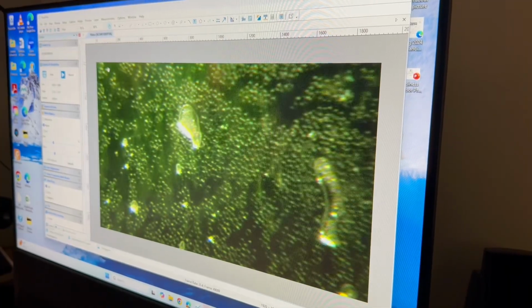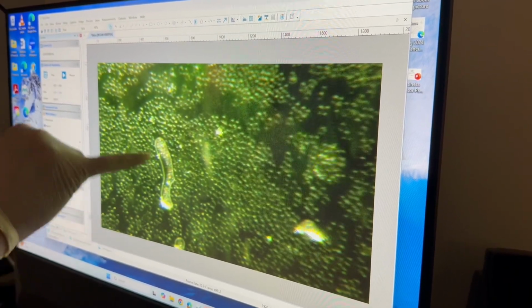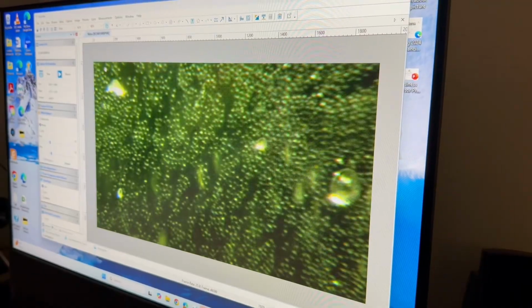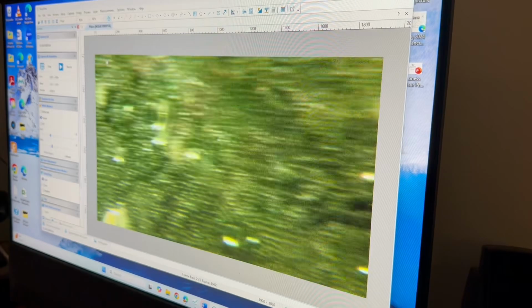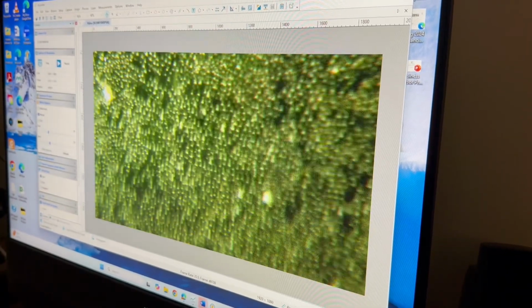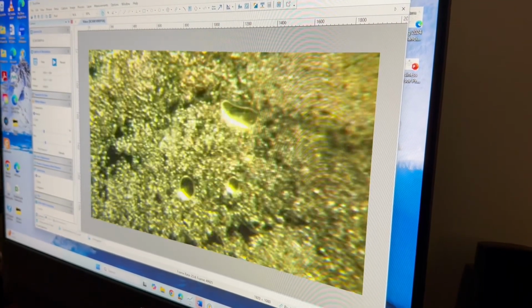No kidding. Yeah. So like these are graphene oxides that are sitting in there. These are the stuff that people talk about causing damage to the body that shouldn't be in the body. So I'm kind of hunting for graphene oxide. This is a lot of blood, and I'm kind of just looking through it.